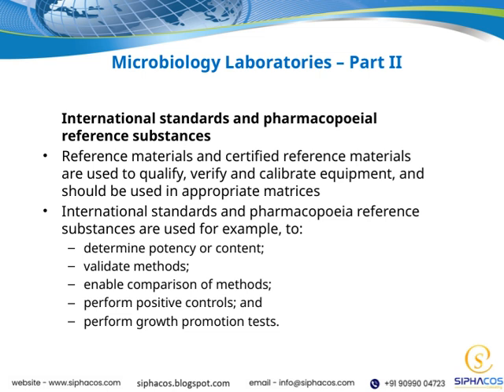We also use them to perform positive controls, which confirm that our methods are working as intended, and to conduct growth promotion tests, especially in microbiology labs, to verify that our culture media and testing conditions support microbial growth. Overall, these standards are vital for maintaining the integrity and accuracy of our microbiological testing, and they tie directly into the broader theme of ensuring the quality, safety, and efficacy of pharmaceutical products.